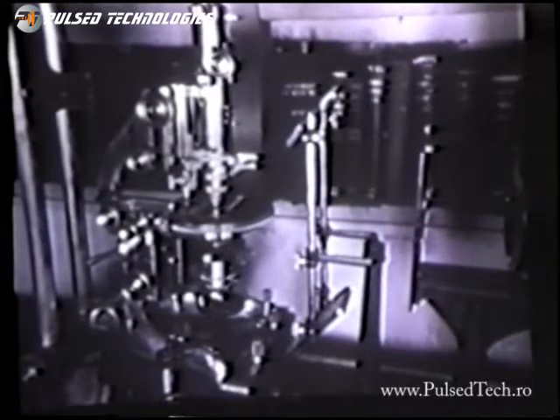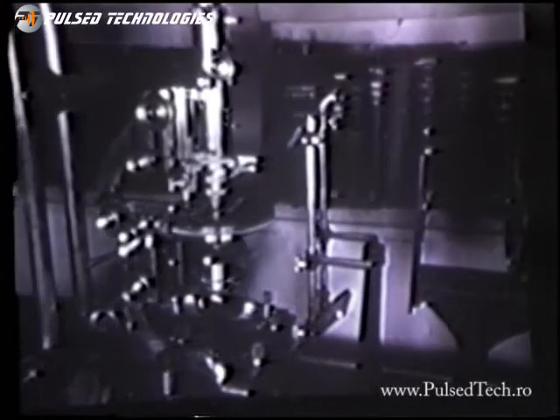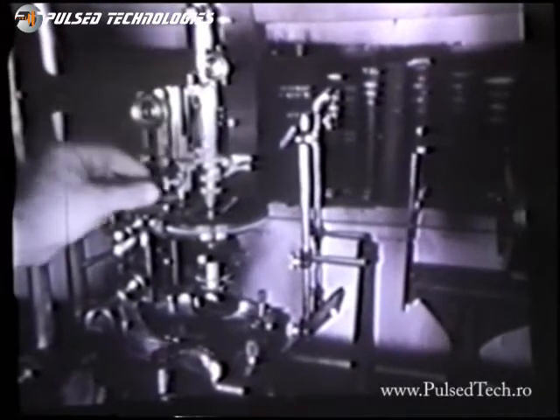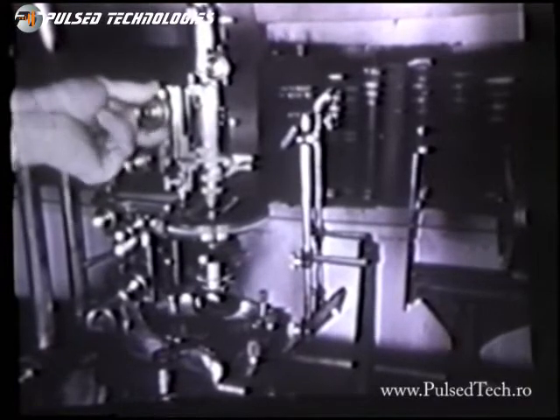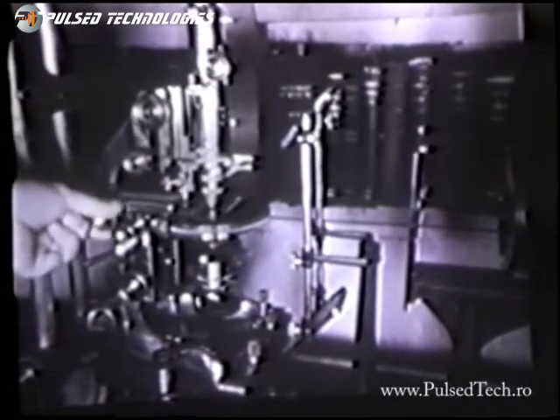This is a petrographical micropolariscope used by Rife for chemical analysis and for observation of the bacteria and virus, which was transmitted up through the 40-inch bellows of the Leitz optical bench so that photomicrographs could be made of the bacteria and other entities.